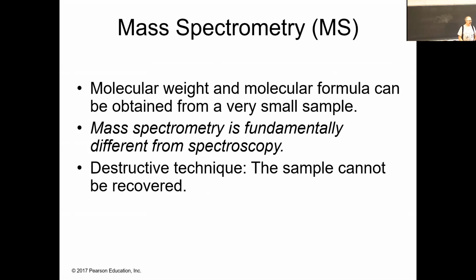Okay, the importance of mass spectrometry is that it enables us to determine the molecular weight and sometimes the molecular formula. It uses a very small sample. It is fundamentally different from spectroscopy because it does destroy the sample. The sample cannot be recovered.